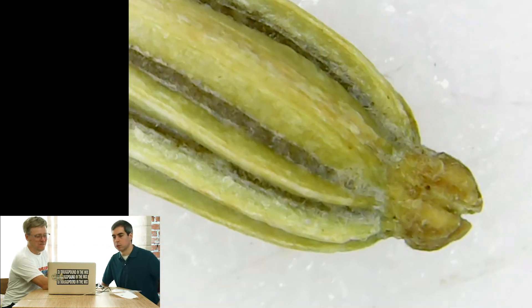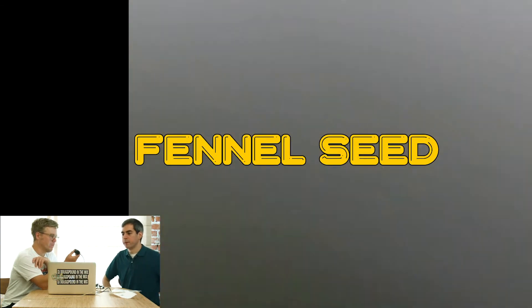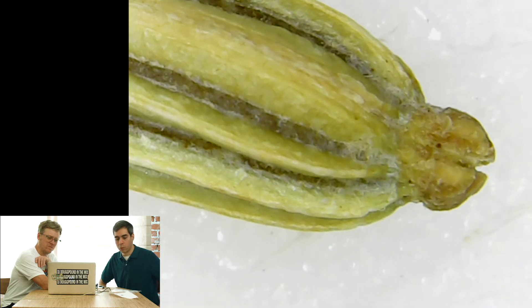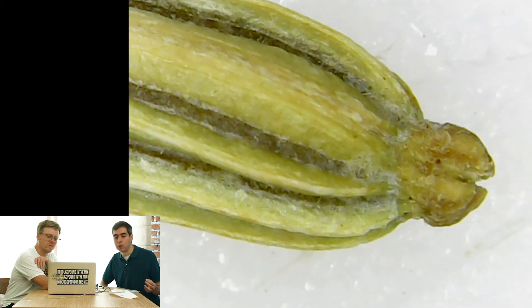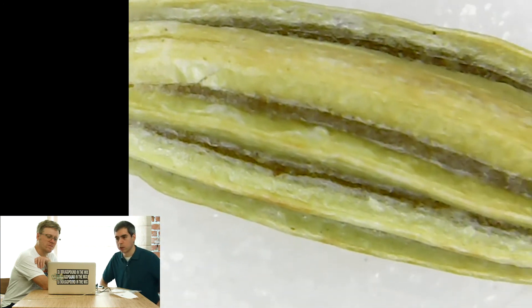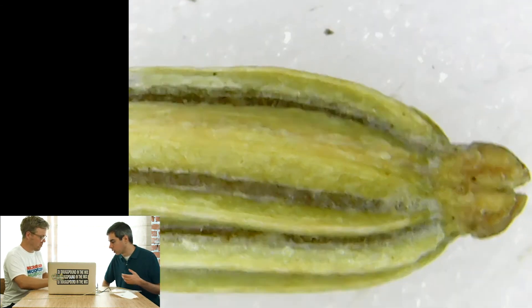So here's what's going on here. Check this out, Brent. It's a fennel seed with the microscope. Here's what happened — when we looked at the Herbes de Provence, there was a fennel seed in there and we thought it looked cool. And I think there were maybe a few comments asking why didn't you cut the seed open? And I thought, yeah, why didn't we? So we wanted to revisit the fennel seed and cut it open.